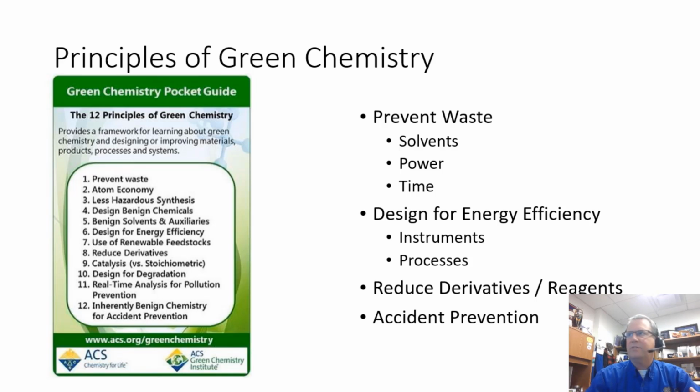We're going to think a little bit about the principles of green chemistry and how perhaps they apply to analytical methods. First of all, we think about preventing waste. Analytical methods use a lot of waste. A little later on, I'm going to talk about solid phase microextraction. And of course, you can almost think about that as really the beginning of green analytical chemistry. But we think about using solvents. We think about using power. We think about time efficiency. What about designing for energy efficiency? I think that's one thing we're kind of interested in about Lucidity's mini GC is that it is a smaller box. It uses less energy than a full-size instrument, and I think that can be very attractive.